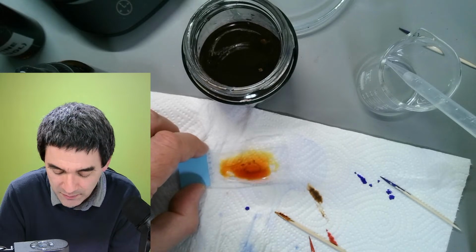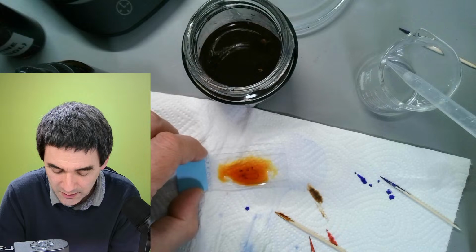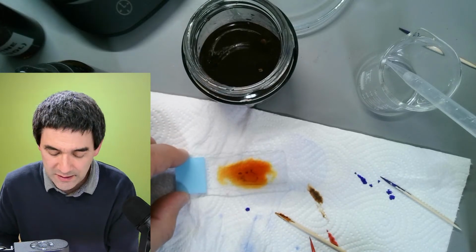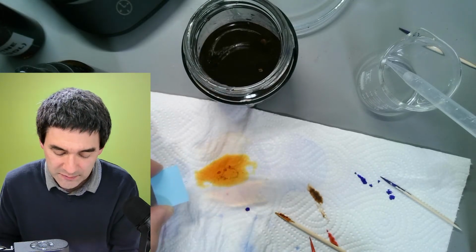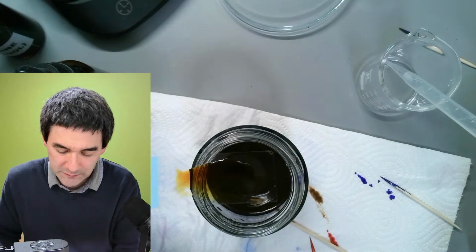Okay, I guess the minute should already be over. So what I'm doing next is I'm going to rinse it again.